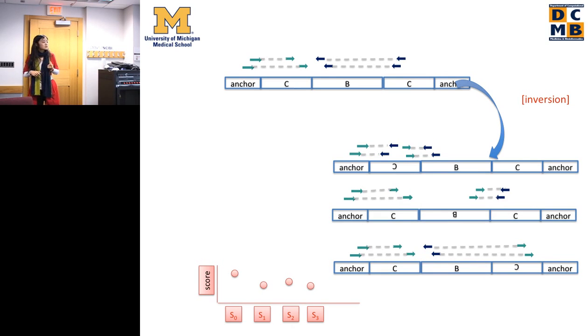Well, for this, the directions are wrong. So maybe this structure shouldn't be scored very well, but we have other parameters, like maybe in this structure the coverage becomes very bad, or the insert length becomes very bad here. Anyway, this is the score we got, and then we choose a structure based on the score.